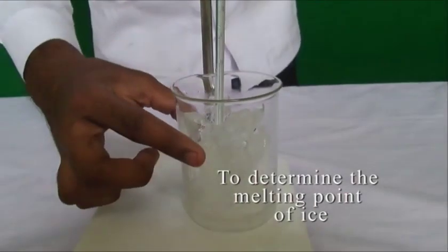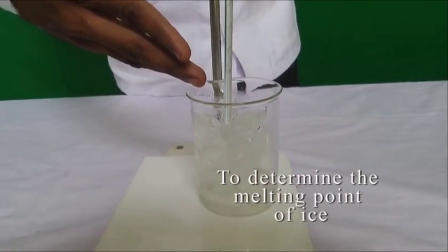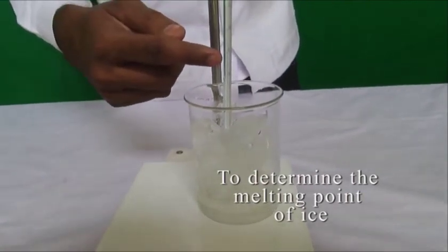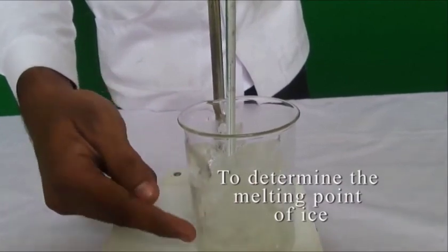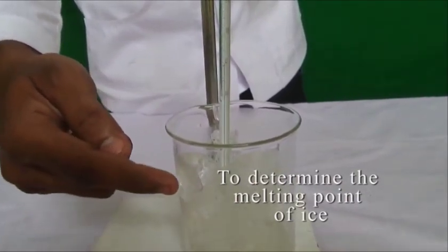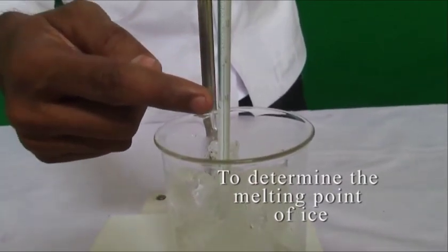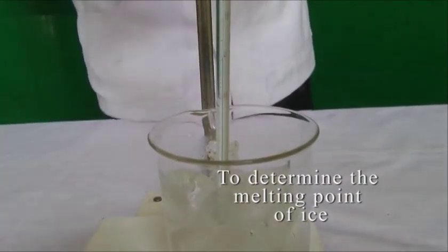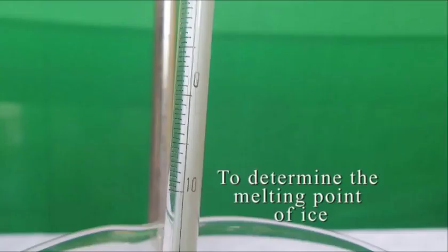To determine the melting point of ice, take a beaker half filled with dry crushed ice obtained from distilled water. Suspend a Celsius thermometer so that the bulb of the thermometer is completely surrounded by ice. Read the thermometer and record the temperature after every 1 minute till the ice melts and the thermometer reading remains stationary for 2 minutes.